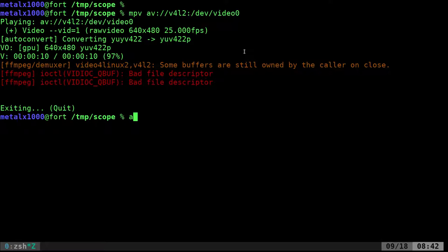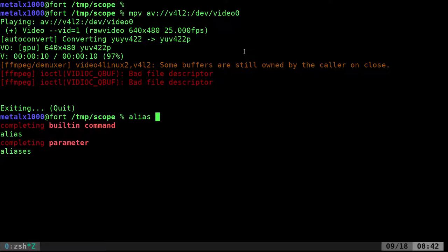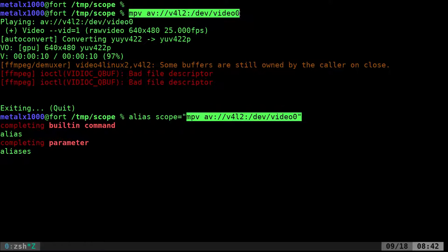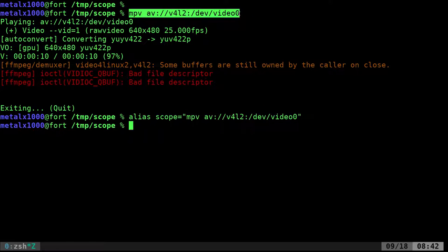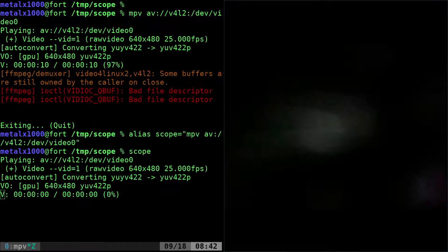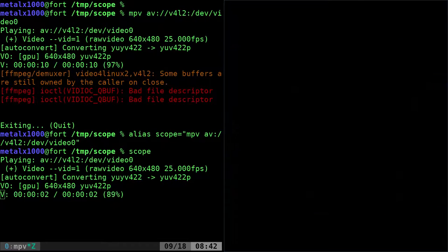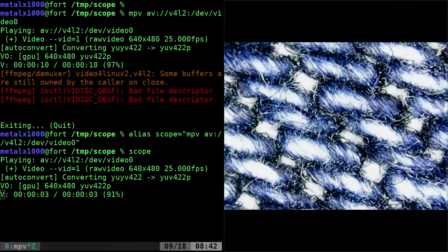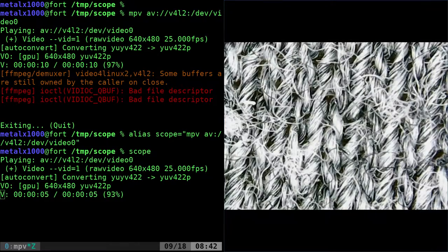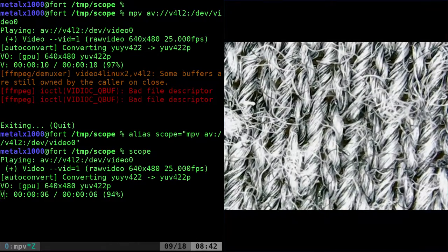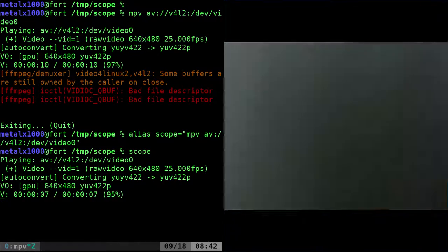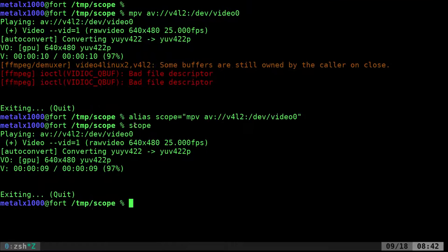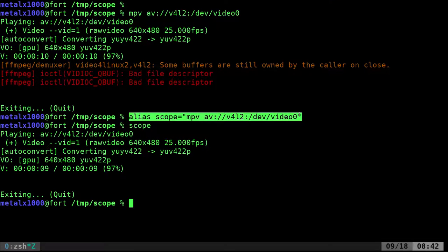But it'd be easier if you alias it. For example I could say alias, I call it scope equals, and then paste that command in there. Then at any point after that I can type in scope and it runs that command for me. Again here's my denim jeans, here is the fabric on my t-shirt.